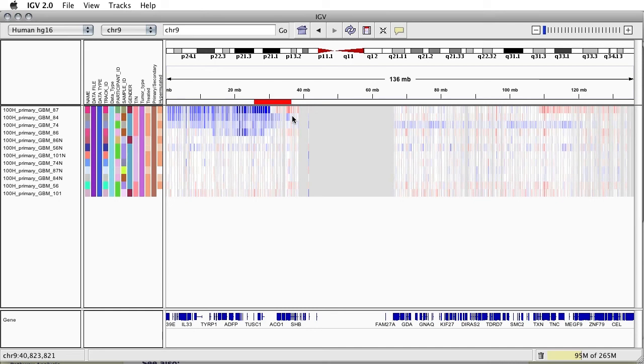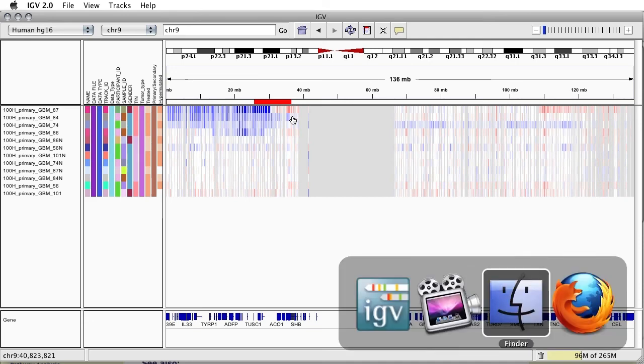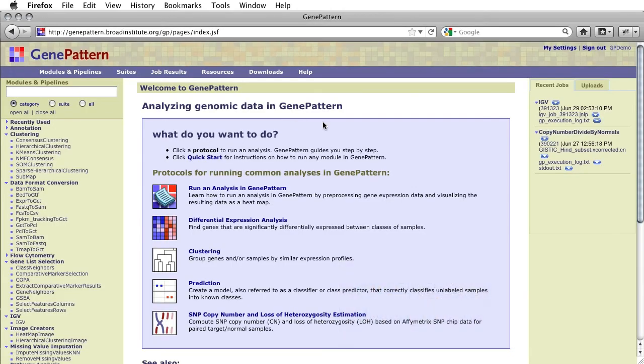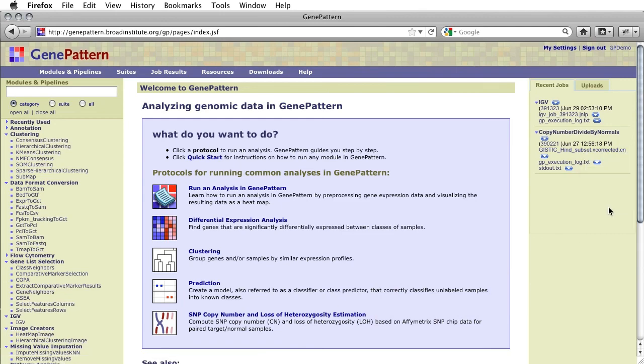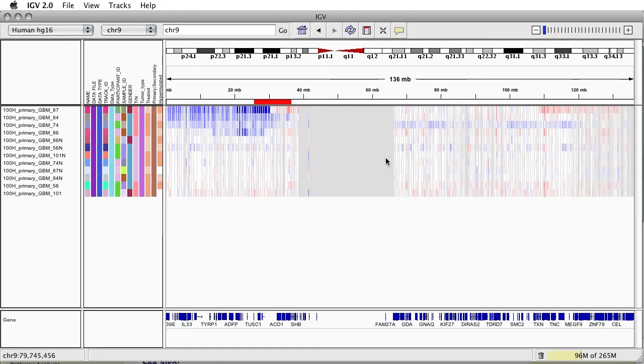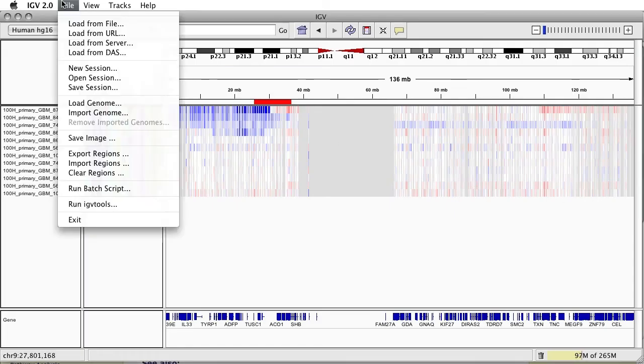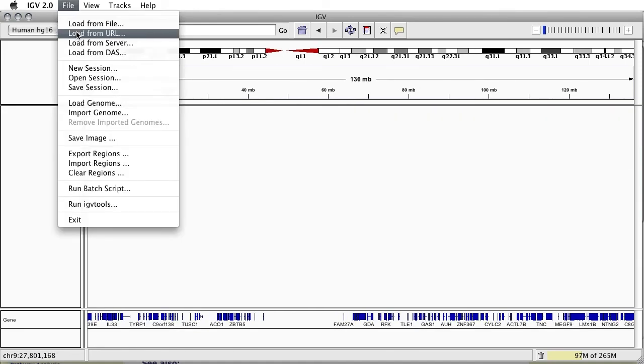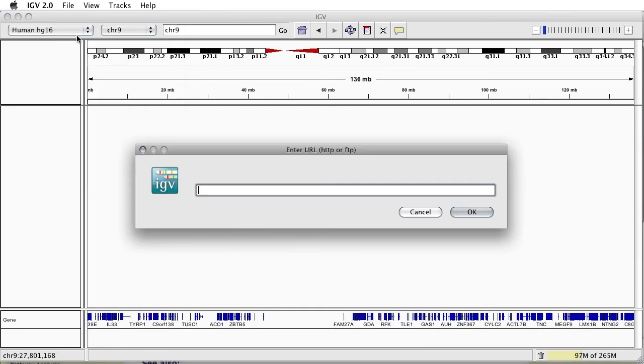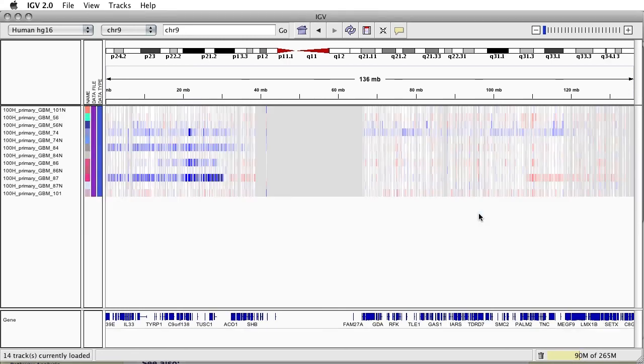One last feature to note is the ability to copy and paste a GenePattern result file URL as input for IGV. This feature became available with the release of GenePattern 3.3.2 and IGV 2.0. To use this feature, simply right-click and copy the URL of a job result in GenePattern. Then in IGV, select File, Load from URL, and paste the GenePattern result file URL into the provided field.